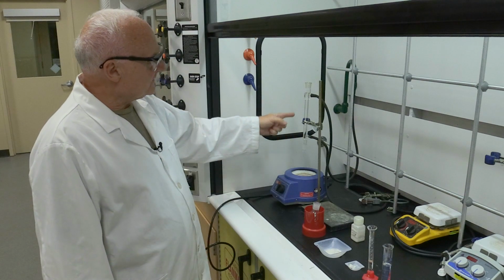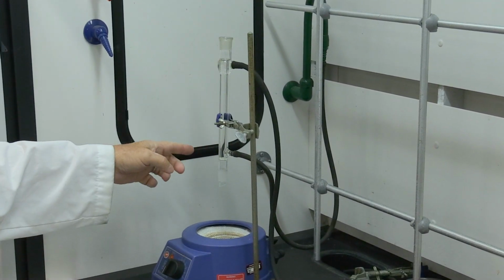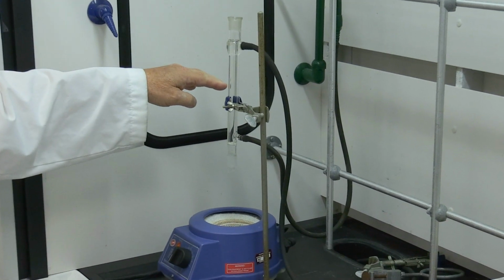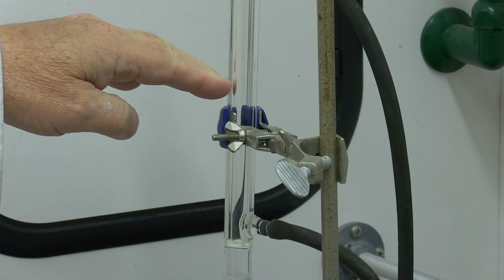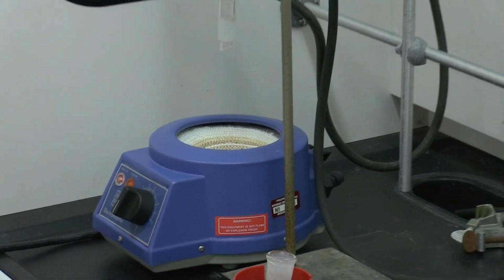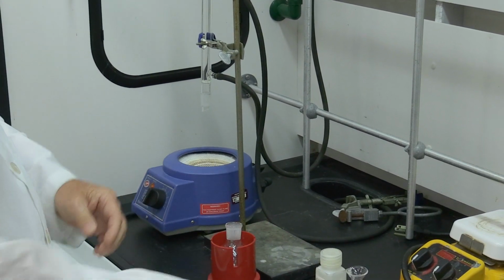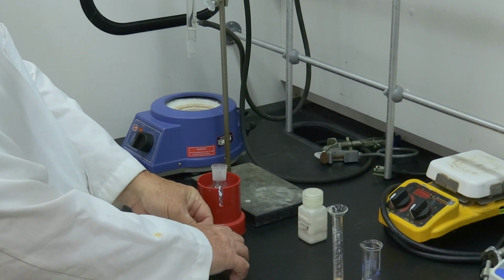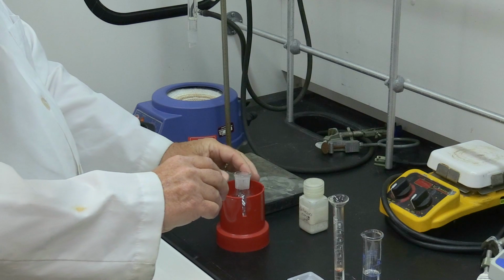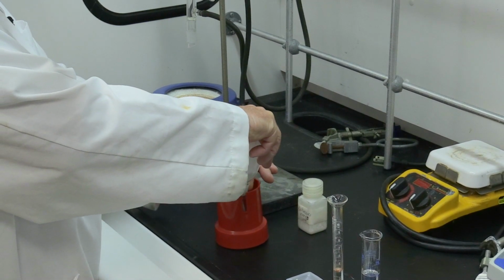It's countercurrent flow. The water comes in to the outside cooling chamber, and as the vapors come up into the reflux area, they condense and fall back down, and the reaction takes place. So we have to reflux for an hour and a half. So again, all these chemicals are pre-weighed. Here is fluorene that's weighed specifically for this measurement.